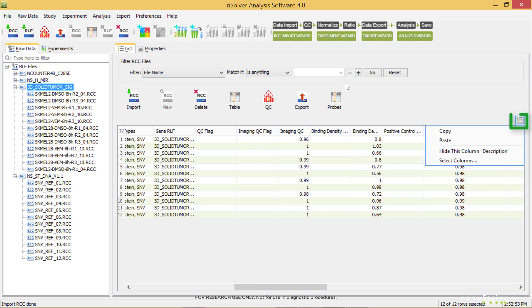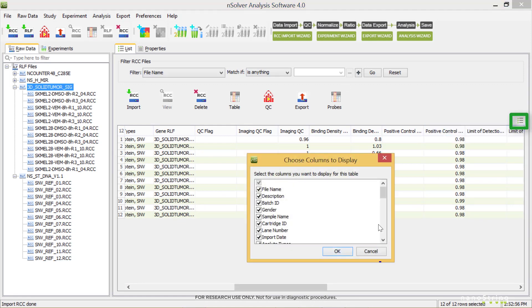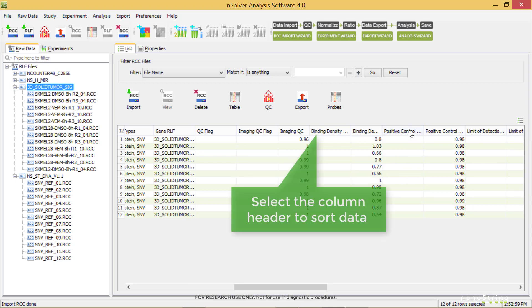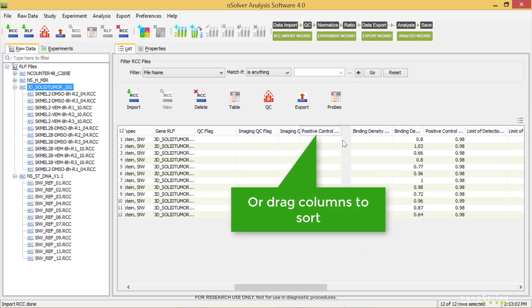Select the Column Options icon in the upper right corner to select columns you'd like to see. You can also select the column headers to sort data, or drag them where you'd like them to be.